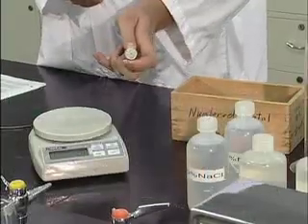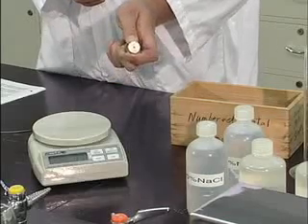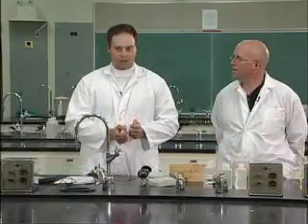Okay, when you pick up your samples at first, make sure that you write down the number and the letters on your sample. Otherwise, you will not receive a mark for your sample. Oh, I didn't know that. Yeah, that's a good one. Make sure, for example, this one here is labeled number 6 tin or number 6 Sn. So make sure you write that down before you weigh your sample.